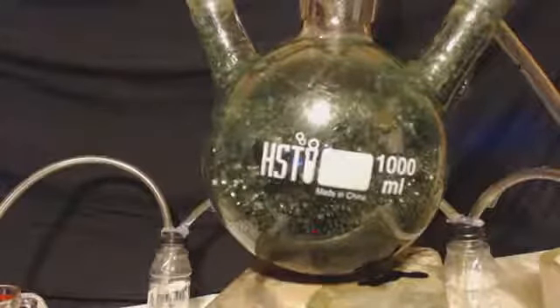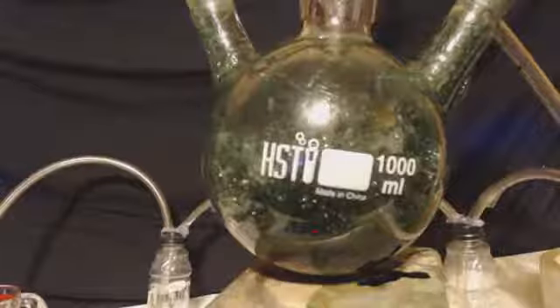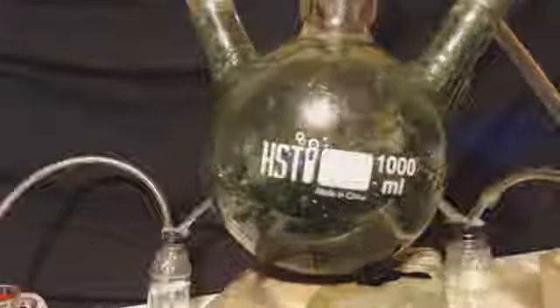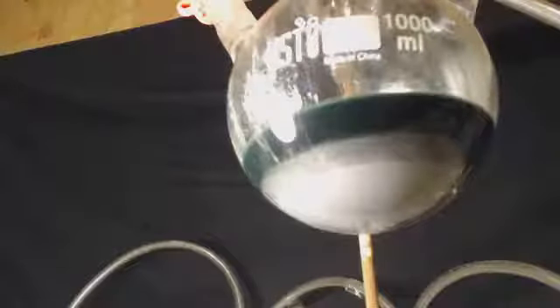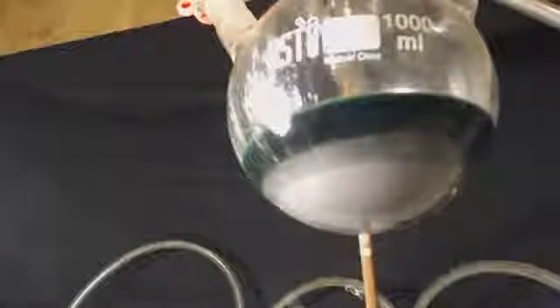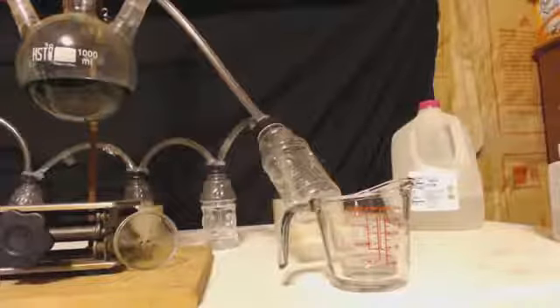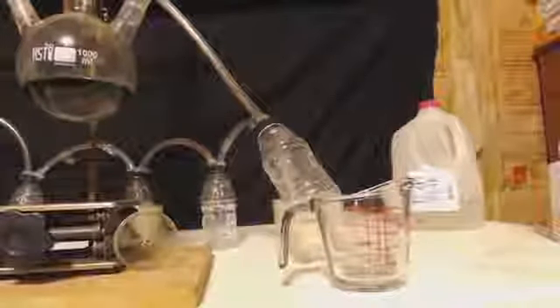That's probably going to fall in about the next 3 seconds. Oh, 2 seconds. You can see at the bottom there, that gray part, it looks like two layers, but that gray bottom layer is just a thin film. The spin bar pushes it up against the sides there, and it looks like it's half full, but it's just the layer.